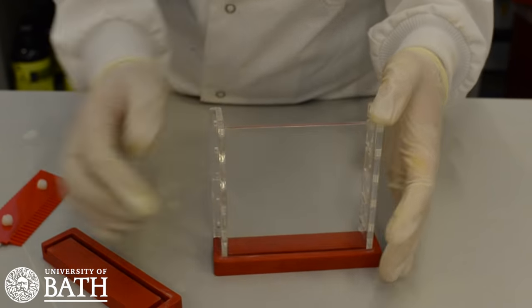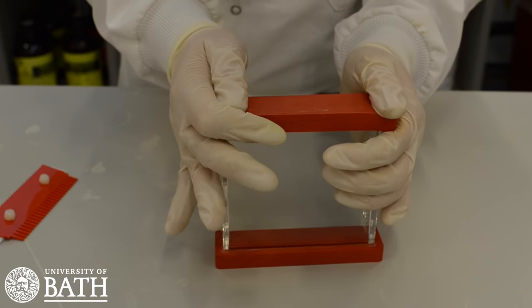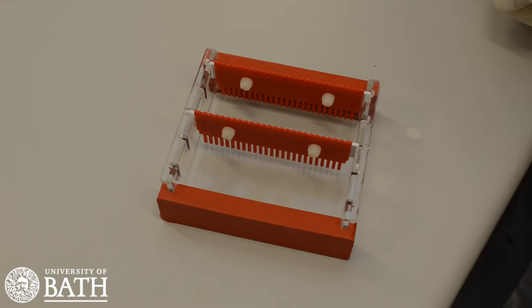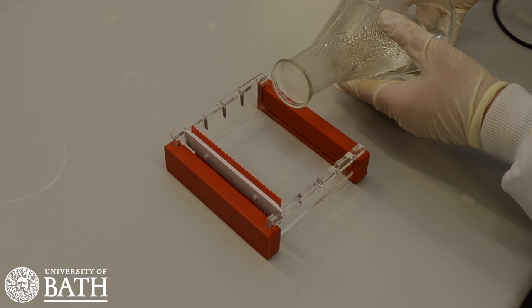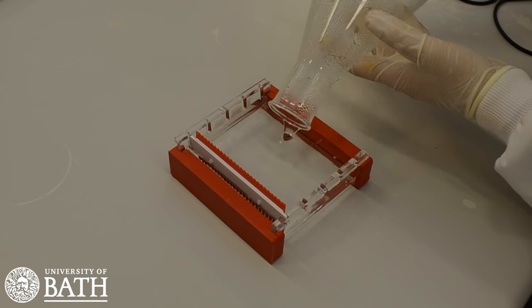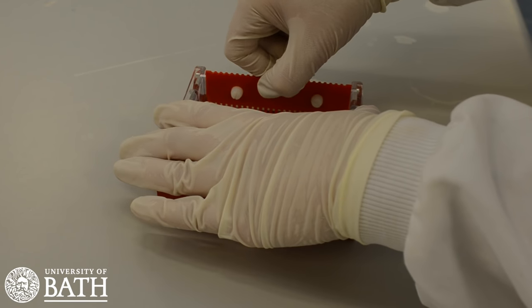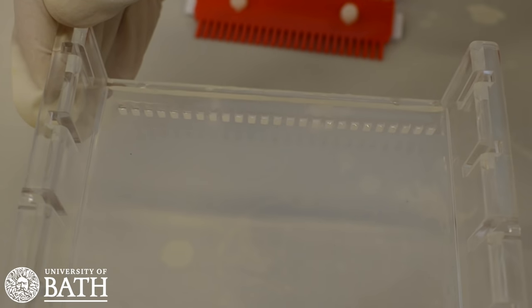Assemble the casting tray, making sure that the rubber seals on it are tight. When the casting tray is assembled, take the sample comb and place it across the tray within 2cm from the end. If you want to increase the number of samples run on one gel, you can also place a sample comb in the middle of the tray to create more wells. Note that the agarose needs to have cooled to 60 degrees Celsius before pouring. Leave the gel to cool and solidify for 10 to 20 minutes — it will be translucent when ready. When the agarose gel has set, remove the sample comb; this should have created wells in the gel where your DNA samples will be placed.